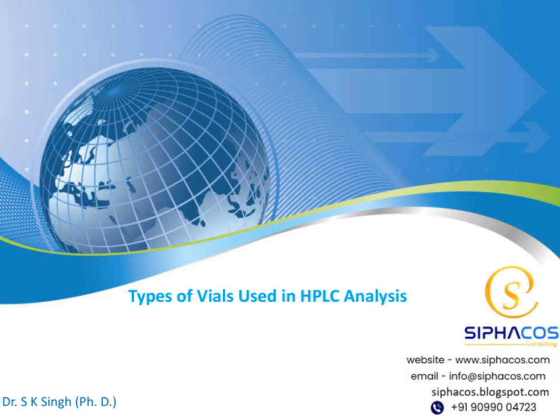Today's presentation is titled Types of Vials Used in HPLC Analysis. We'll be exploring the different kinds of vials that are essential for high-performance liquid chromatography. Over the course of this session, I'll walk you through the various types, their features, and how to select the right vial for your analysis. Let's get started.